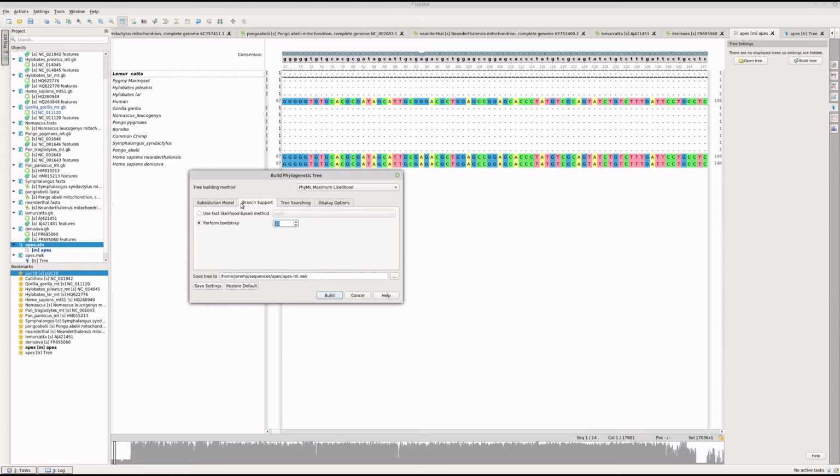And so bootstrap is basically how it's matching up these scores of these sequences in the alignment, and actually trying out how well they fit in a certain location on a tree. And it's trying it out multiple times. And that's what a bootstrap is, to see the correctness of that fit, right? And so it'll grow a leaf on it, and it'll prune a leaf, statistically speaking, right? And so there's all these things. You can also train it a little, right, against other trees and other things that can happen here.